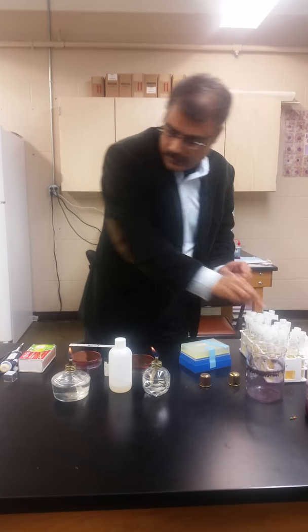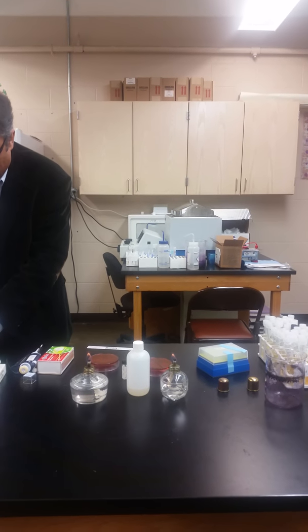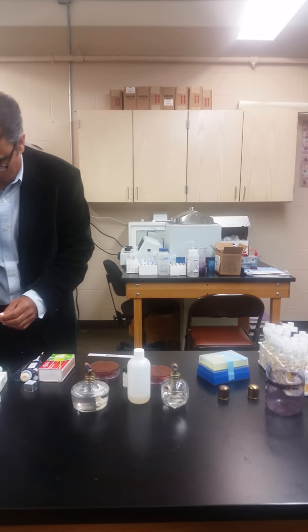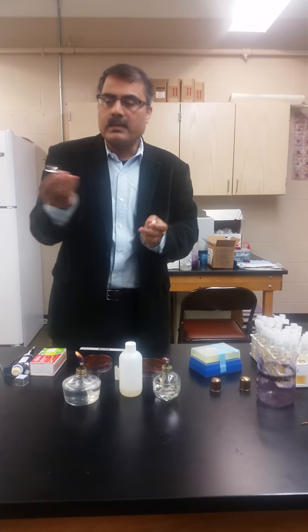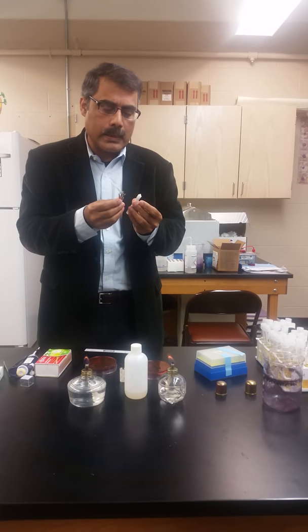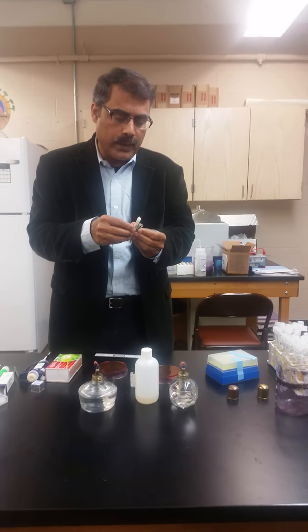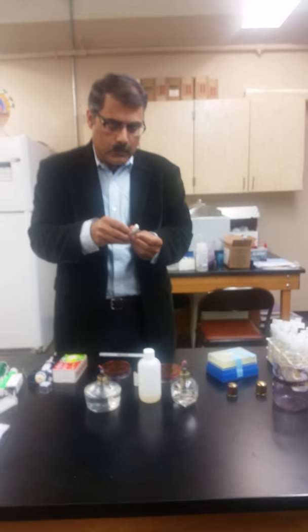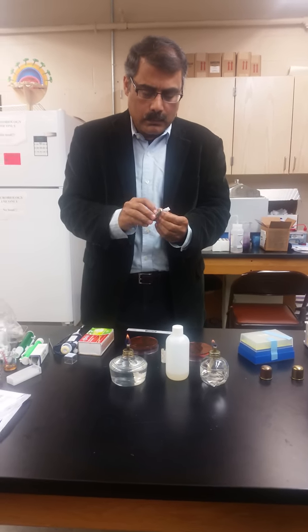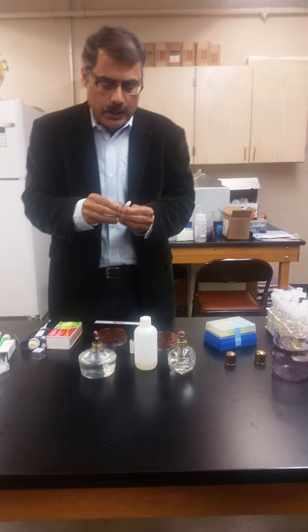Now, these antibiotics, they come soaked in a filter paper disc, and they look like this. Okay, so you can pass them around, and people can look at it. There is a little dispenser for taking these very tiny discs out, and this helps in not touching them with your fingers, because your fingers may have organisms as well as some oils and stuff which can inhibit the drug. So you don't want to touch it.